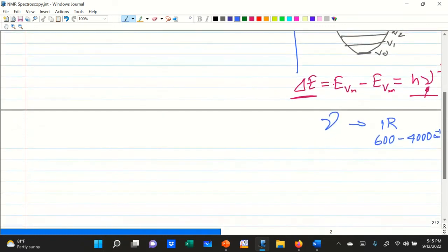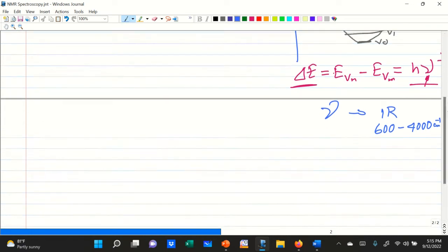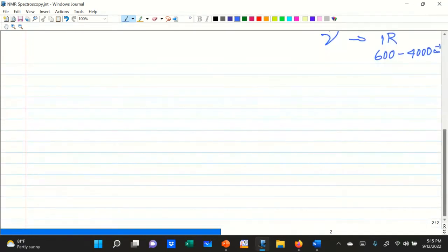So that was the vibrational absorption spectrum you saw, due to this vibrational transition. Keep that in your back burner. Now, so that's that.